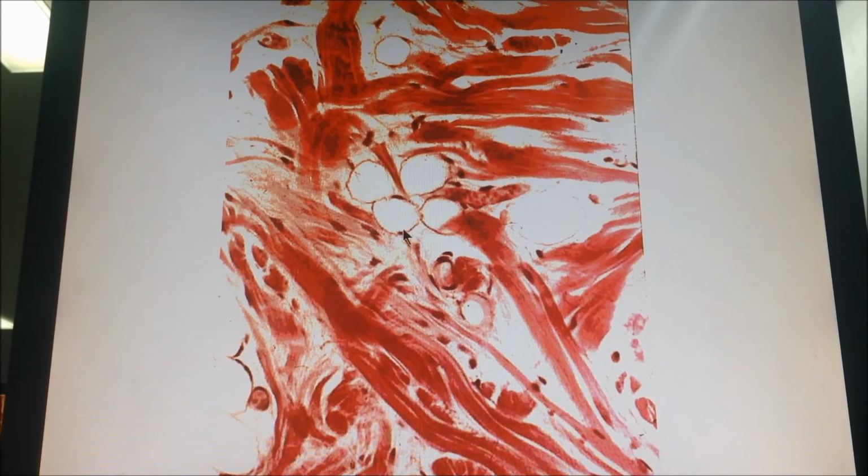Over here, in the middle, you see large cells, mainly empty. On the periphery, a very peripheral nucleus. شكلها زي الرينج, زي ختم signet ring. This is the adipocyte, the adipose cell. Each adipocyte contains one large lipid droplet, and this single large lipid droplet pushed the nucleus extremely peripheral, so it appears like this.